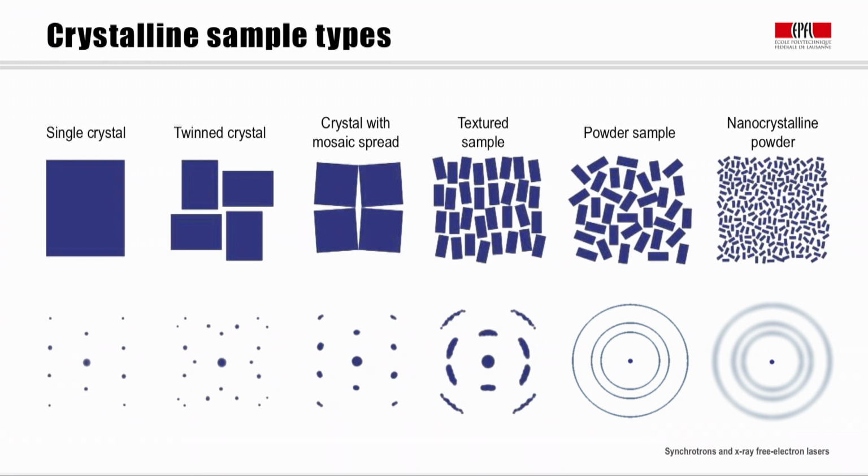Powder samples consist of crystalline grains that have no preferred orientation in space and are significantly smaller than the illuminated volume. For some samples, this latter condition may only be poorly met, in which case the sample can be spun in order to record a spatially averaged signal. Note that for undulator radiation, the focused beam cross-section may be only of the order of a square micron, and the sampled volume may be less than 100 cubic microns.